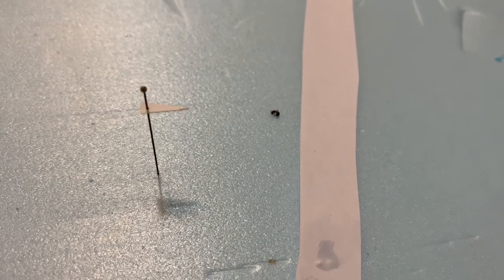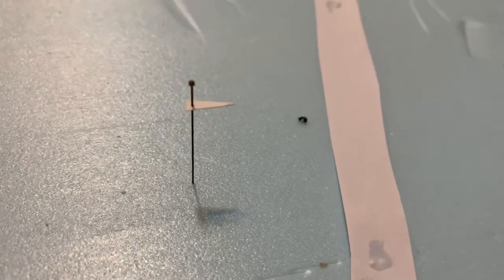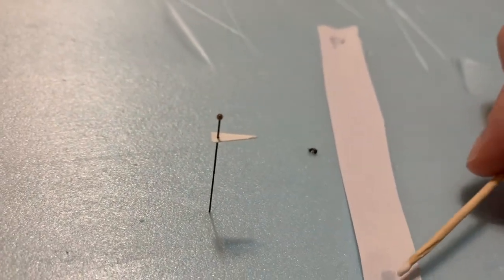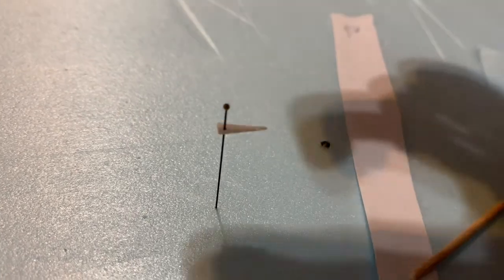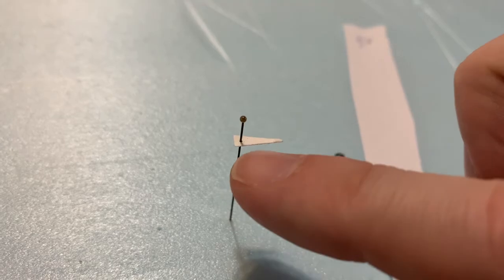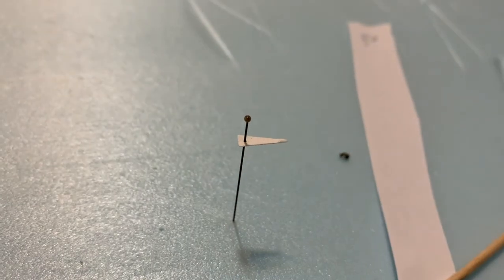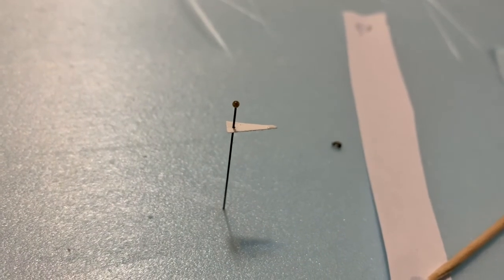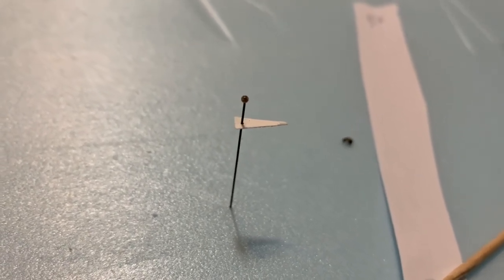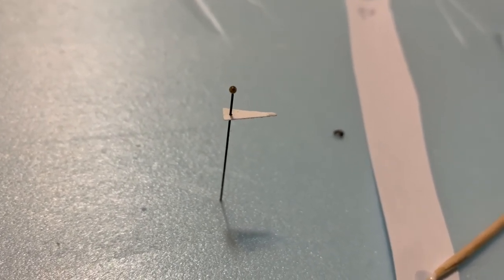All right, so now we're ready to point our insect. You can see that I have the point already on the pin here. The pin goes through the wide end of the point, and the point should be quite high up on the pin, about like this. You always want to make sure the point is on the pin before you try to put the insect on the point. It's much more difficult if you do it the other way around, so this is the practice you want to get into.